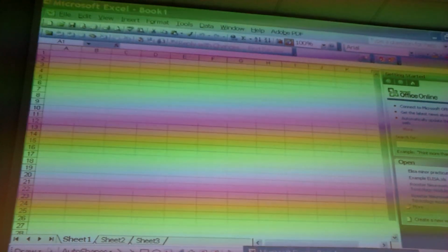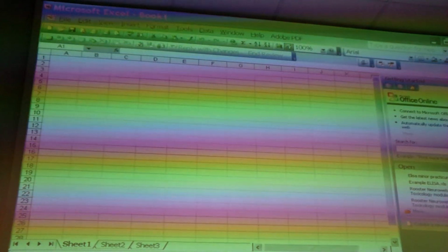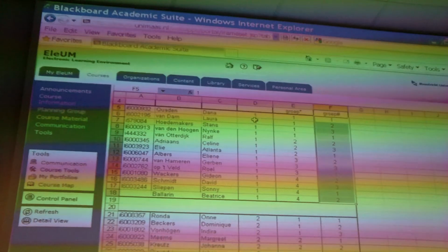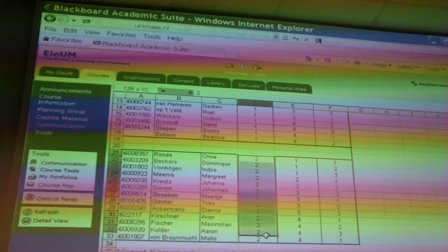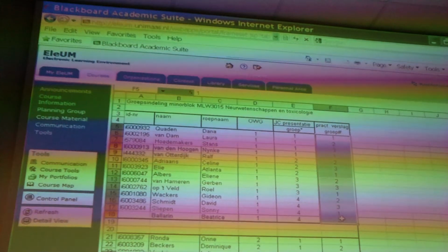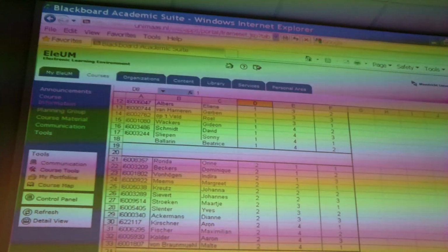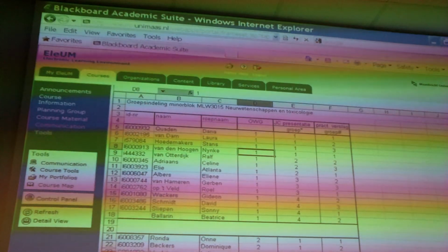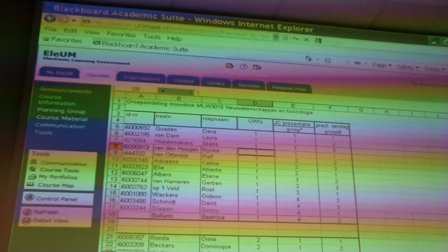And I want you to do that in subgroups, because that's why this was important. Apart from when we meet, which is defined by group 1 and group 2, we've also defined subgroups, 1 to 3 for group 1 and 1 to 3 for group 2. So in total 6 groups. In these groups, I want you to make a layout for the ELISA plate to measure the concentration of 2 samples. And that's what we're going to do tomorrow.